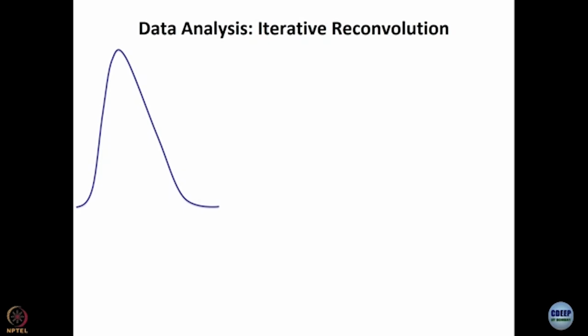Let us see the effect of one such delta pulse. Let us take a small one at initial time, this delta pulse. Well, what I have drawn is not a delta pulse, this is a delta pulse. What I am saying is that is going to give rise to a decay like this. What about the next delta pulse?